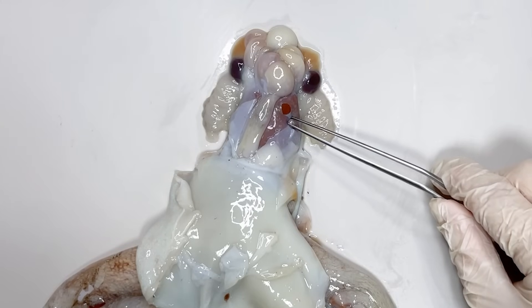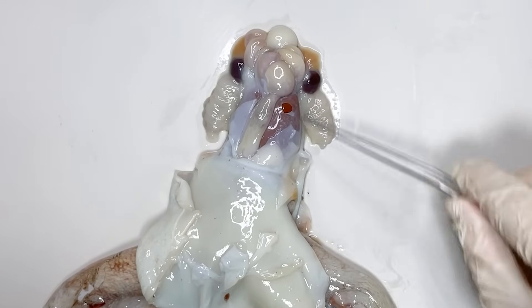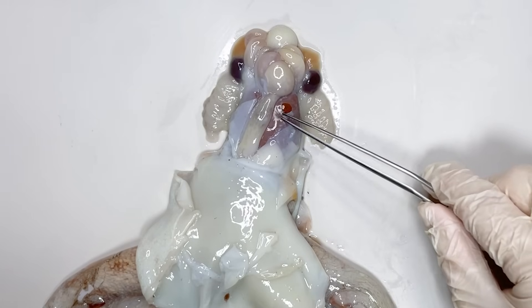And here, in the middle, this largest part is the liver of the octopus. It secretes digestive enzymes and also serves as a buoyancy organ.